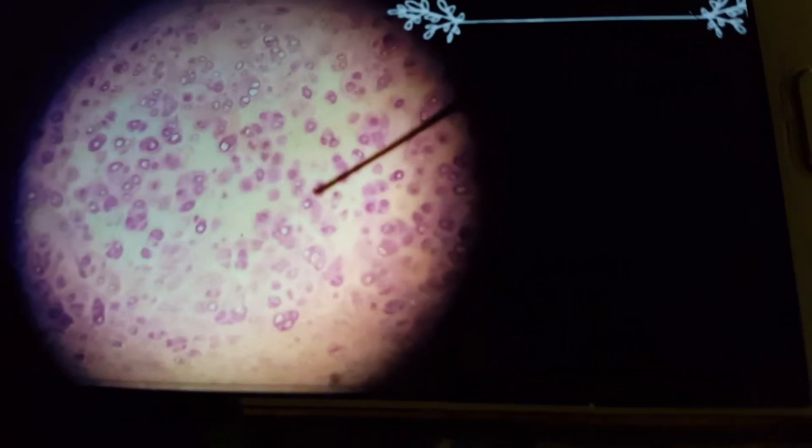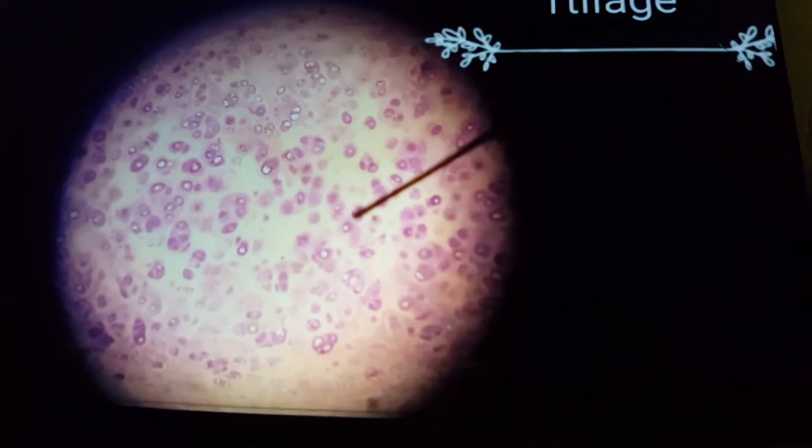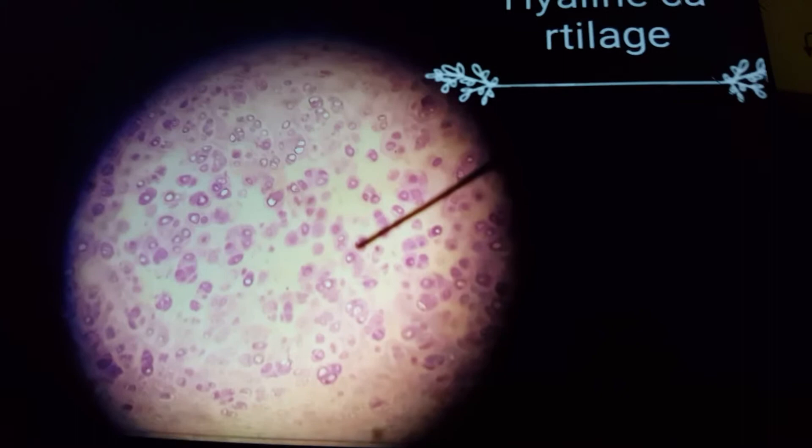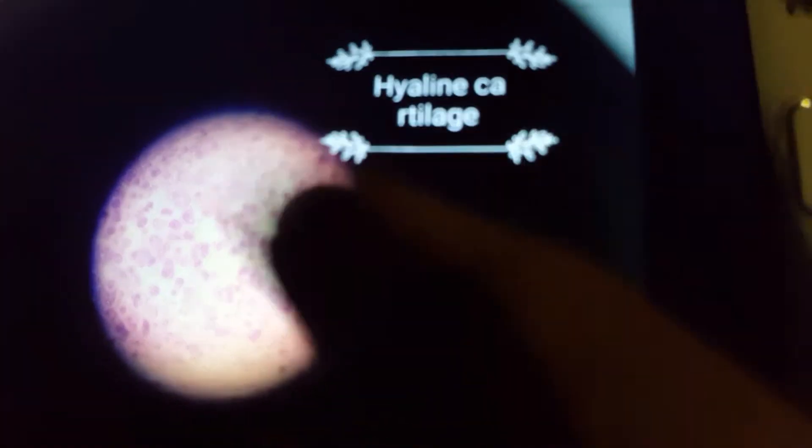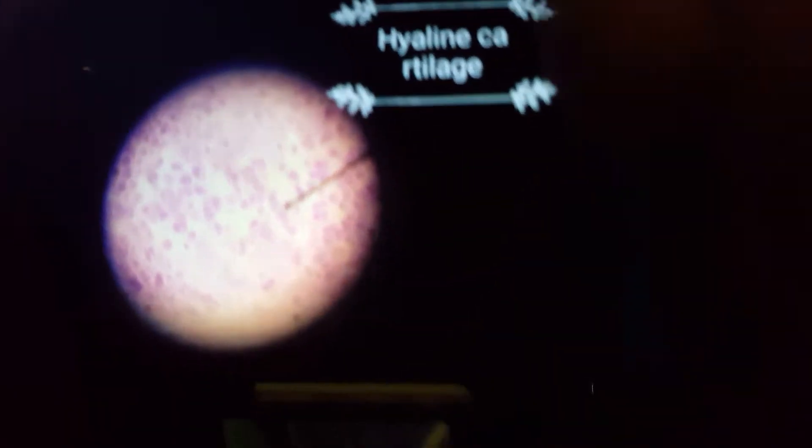The characteristic feature of fibrocartilage is that it does not have the perichondrium. So perichondrium is the key distinguishing feature when identifying hyaline cartilage versus fibrocartilage. I have more slides showing the cartilage.